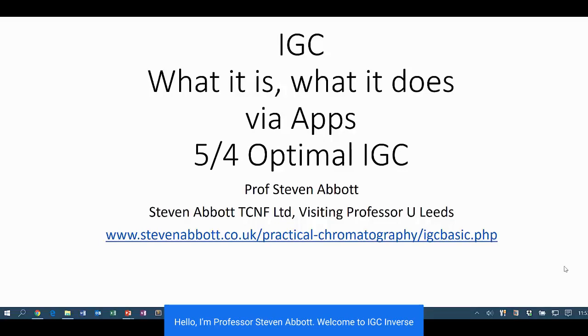Welcome to IGC, Inverse Gas Chromatography, what it is, what it does via apps. And this is the fifth of 4 videos on IGC. Why the fifth of 4? I recorded the 4 and then realised that there was one extra message that I needed to get across about how best to do IGC in practice. Let's go straight to, not the app, but the web page.